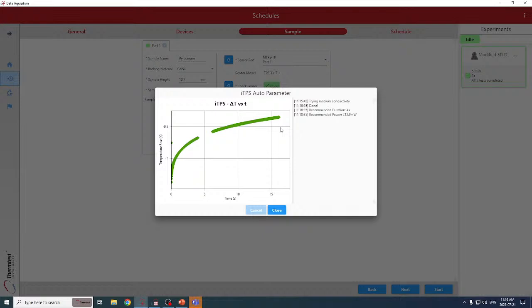That's all fine, but you have to wait 5 or 10 minutes between each of those iterative measurements. This is one continuous measurement with calculations done continuously through the measurement, so that you don't have to stop and delay in between iterations. So you're not getting a disturbance of one calculation range to another. It's a continuous time measurement looking for the edge of the sample. So it saves a lot of time, but ultimately it gives you the recommended time and power.